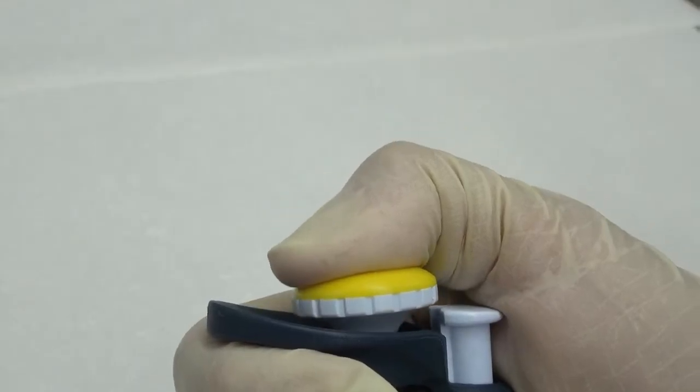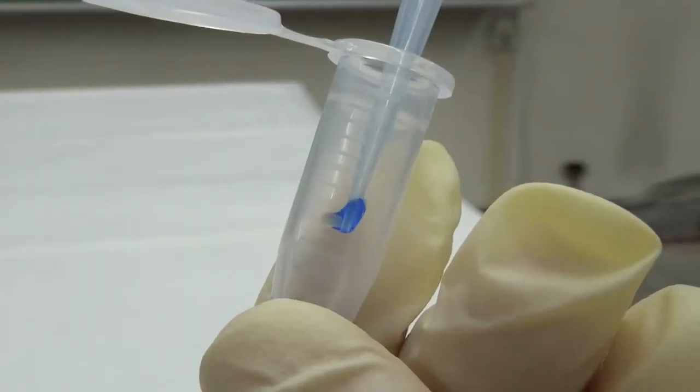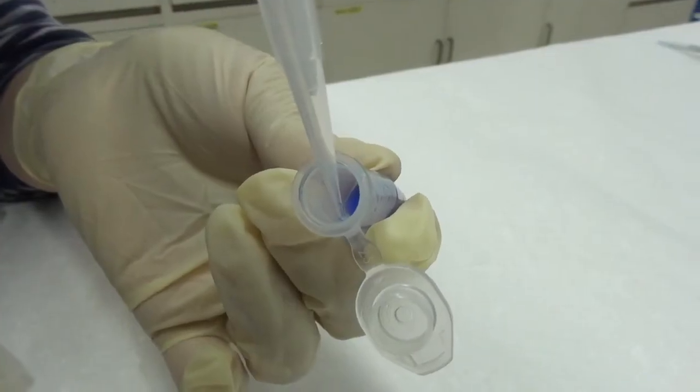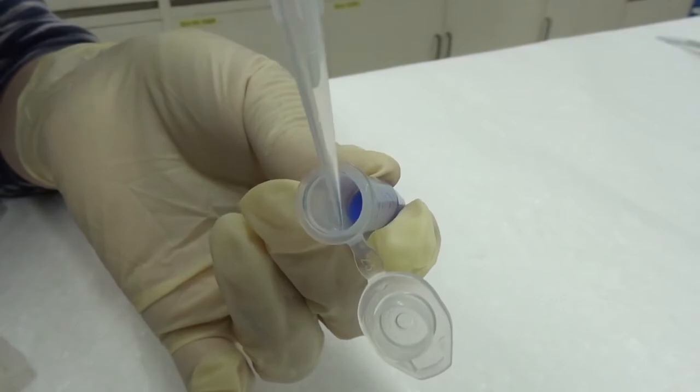Thus, press the operating button to the second stop to blow out the residual liquid. Remove the tip from the vessel, sliding it along the inner wall of the vessel.